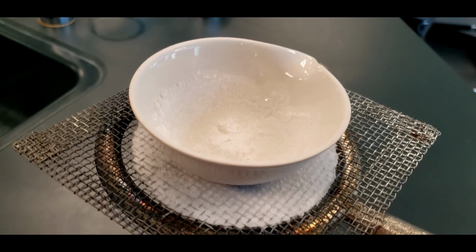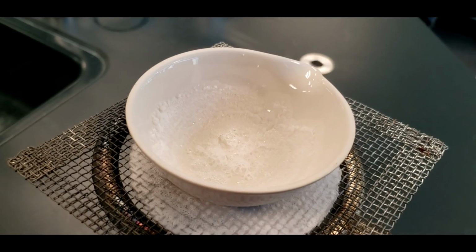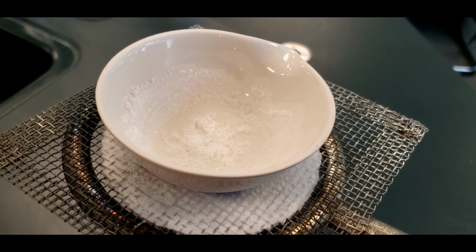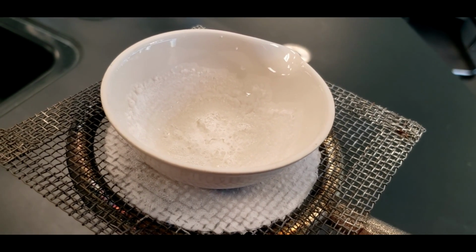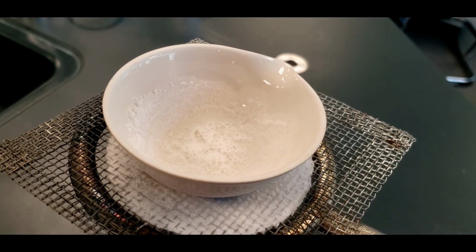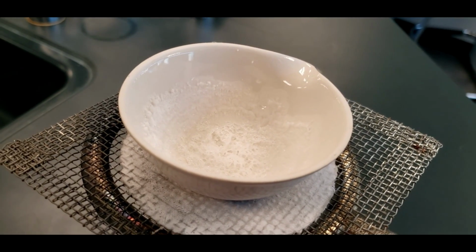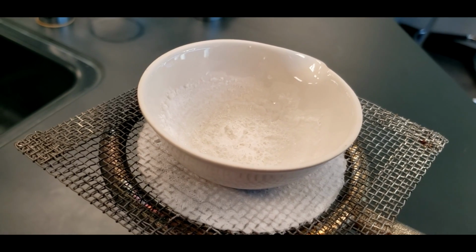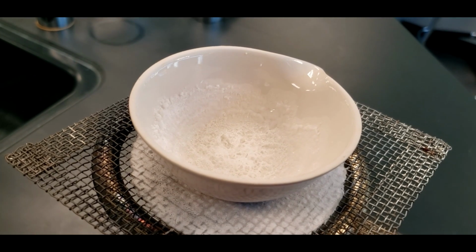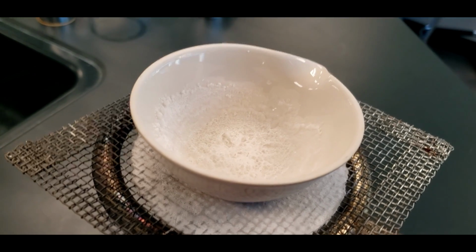You can see. And nearly there. Try one more time, then I'll have to focus on this so I don't send all the sample flying everywhere. You can see it's getting whiter, it's brighter and brighter, and that says the water is leaving the sample. So you might be able to hear it crackling. That's water trapped under the salt that's forming. Sounds like Rice Krispies. And yeah, it's nearly there.